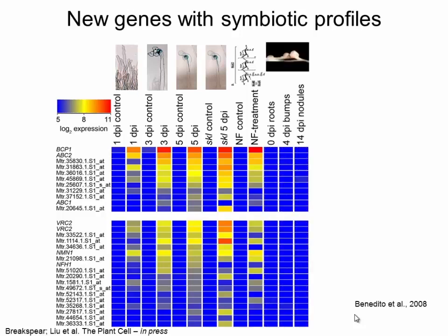So we then added to the normalization the previously published whole root data, and you can see that these guys don't even register a blip in this experiment. So actually looking at and taking the hair really helped.